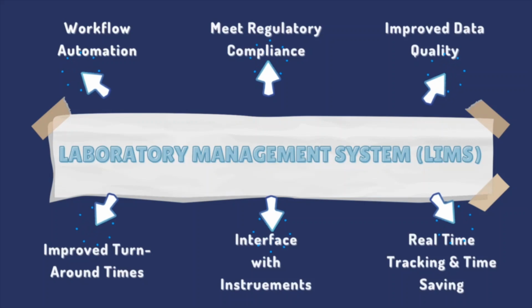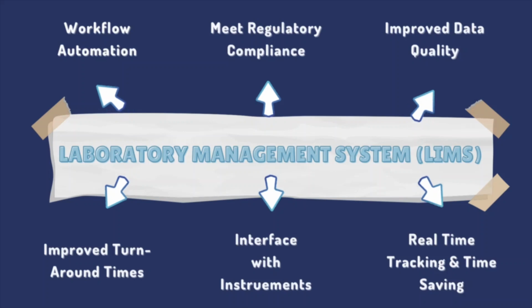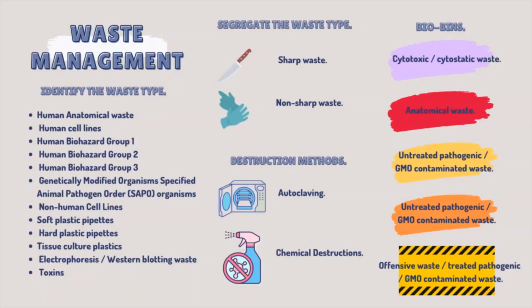this info. The advantages of having a laboratory management system are workflow automation, meeting regulatory compliance, improved data quality, real-time tracking and time saving, interface with instruments, and improved turnaround times. Next, let's look into waste management.